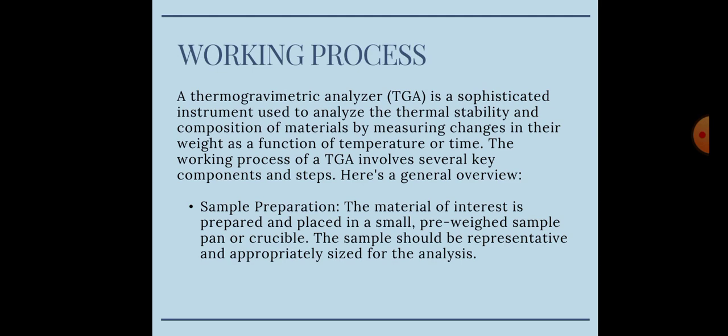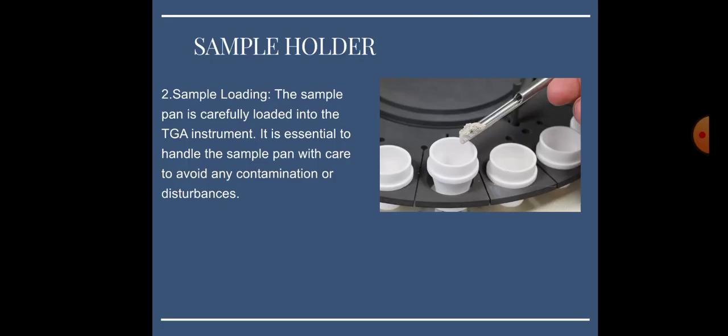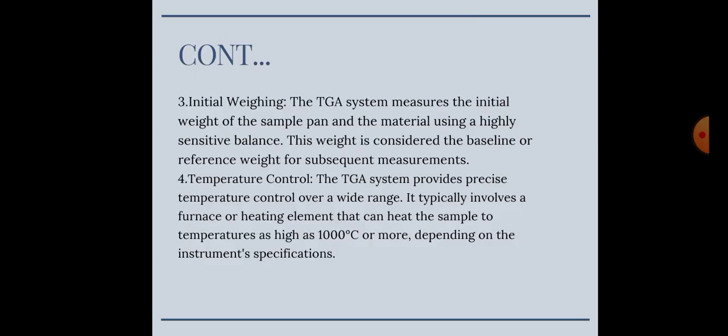The material of sample hold. The sample loading. The sample pan is carefully loaded onto the TGA instrument. It is essential to handle the sample pan with care to avoid any contamination or disturbances.